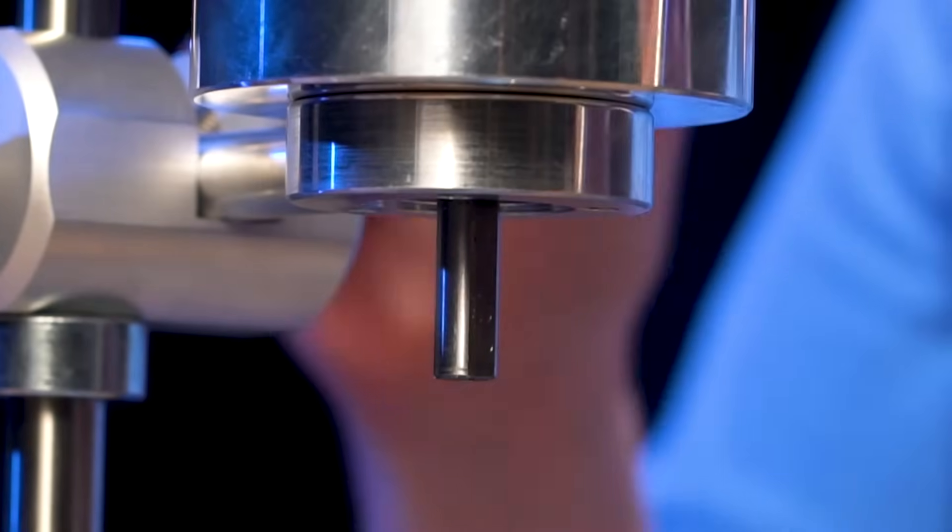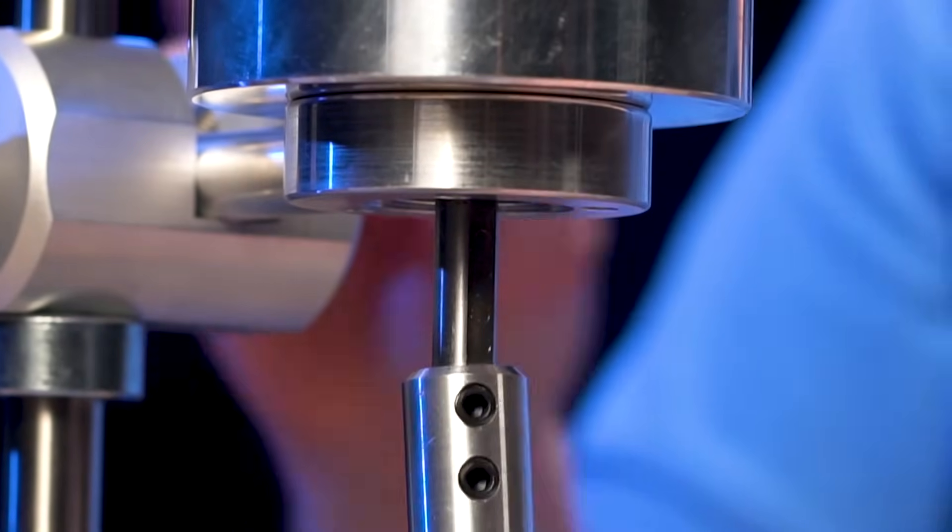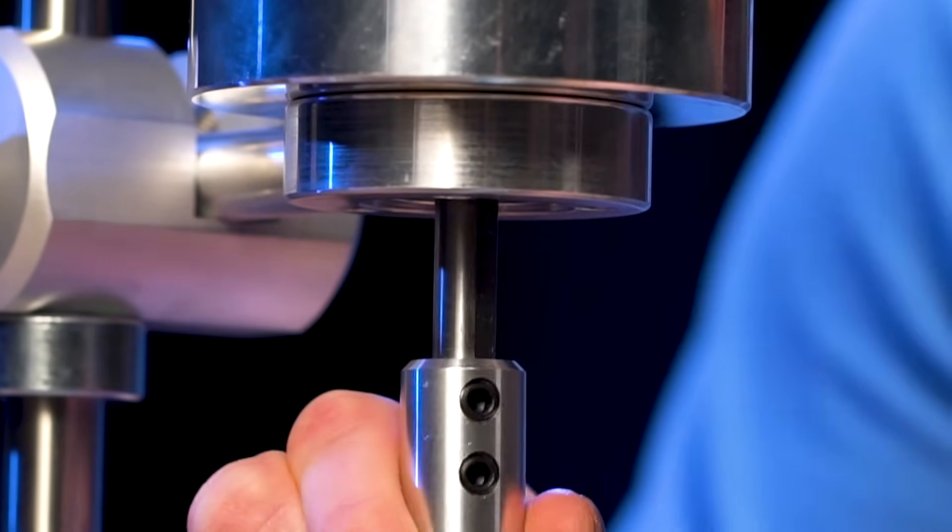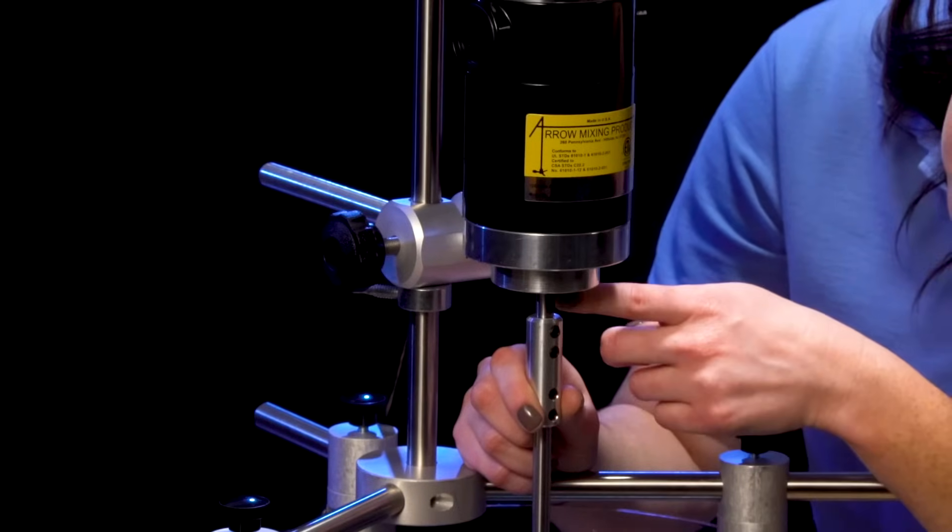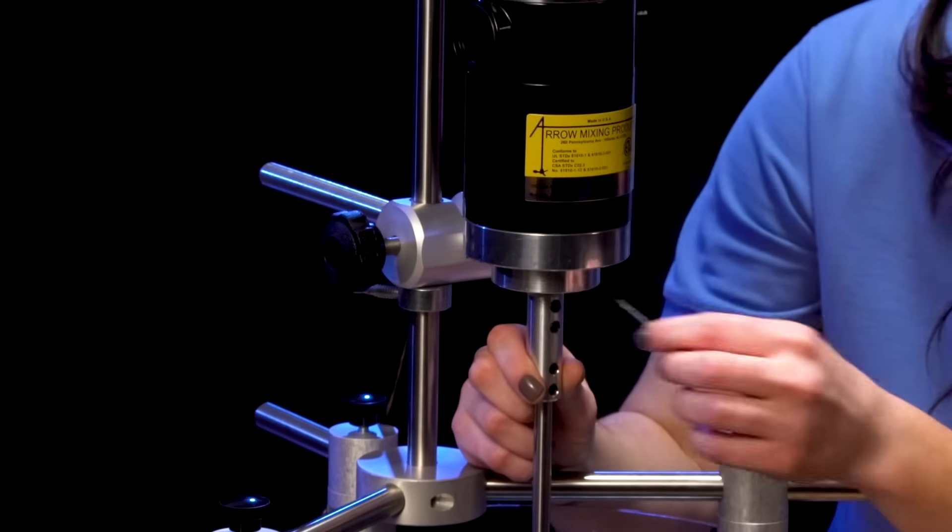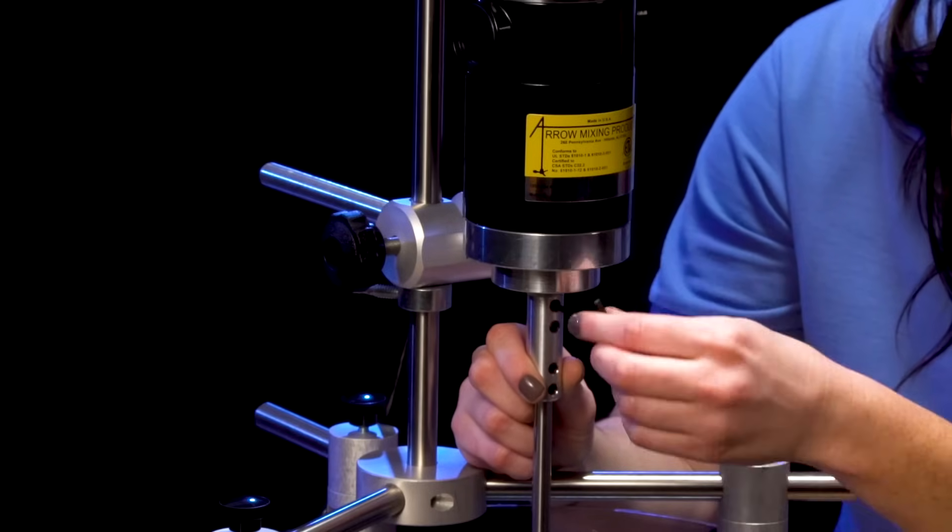Now, attach the propeller shaft to the stirrer. Tighten the top two set screws in the coupling to the flat side of the motor shaft with provided Allen wrench.